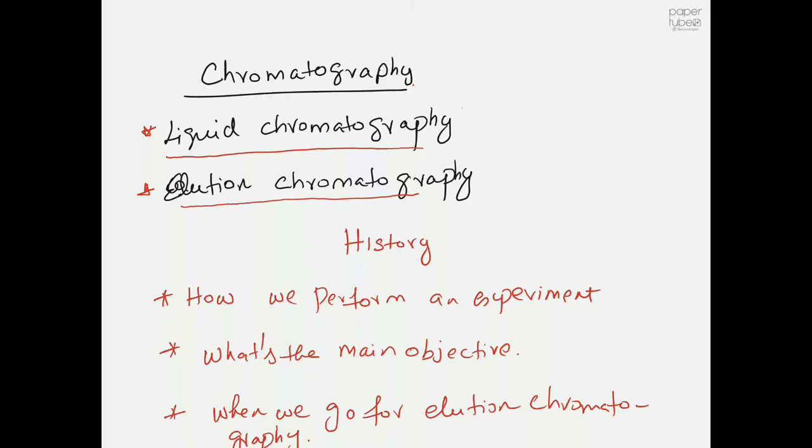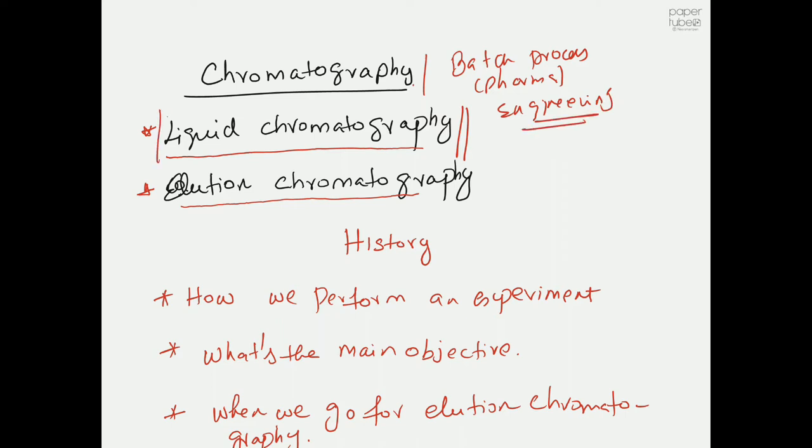In this lecture, we are going to talk about chromatography. In particular, we are going to talk about liquid chromatography because we are studying this module, batch process pharma engineering. So we are going to deal only with liquid chromatography. We will not learn anything about gas chromatography.